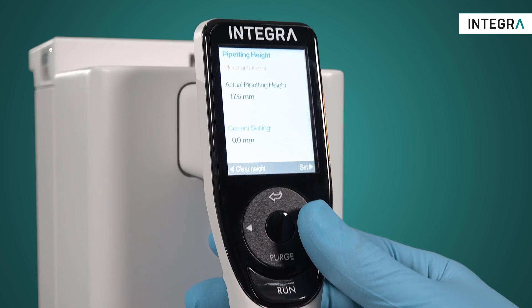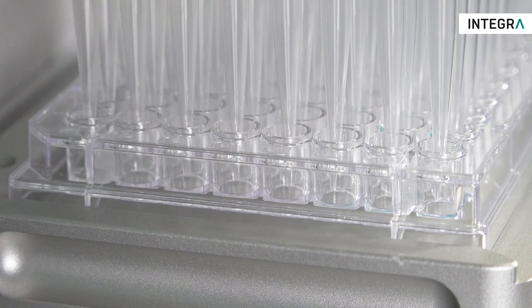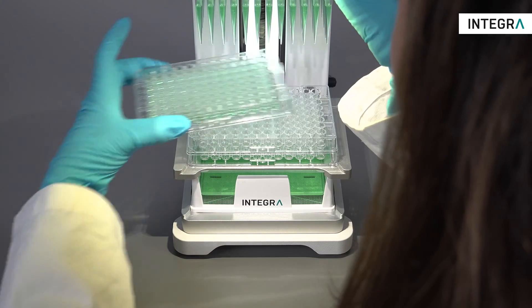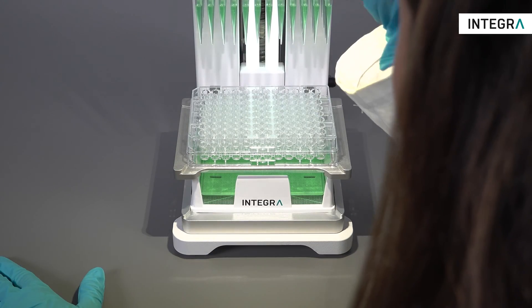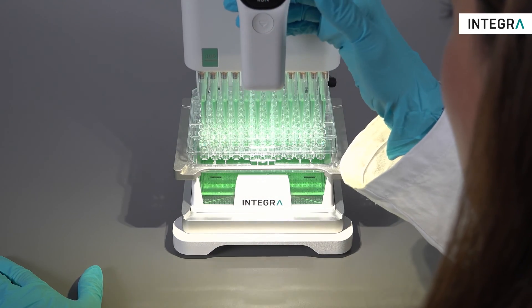Setting a safety bottom, or pipetting height, is simple with the MINI 96. This ensures that the heights of aspiration and dispensing are perfect every time. Multiple pipetting heights can be set within the same pipetting protocol.